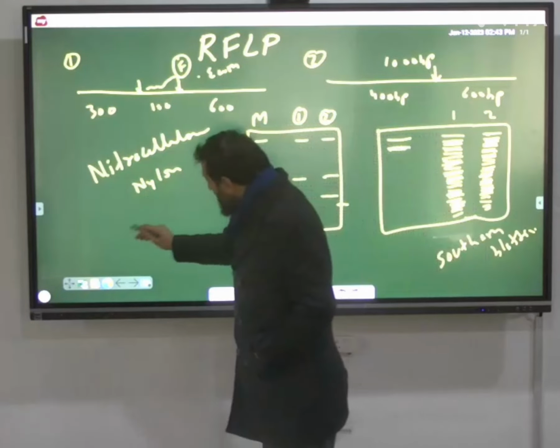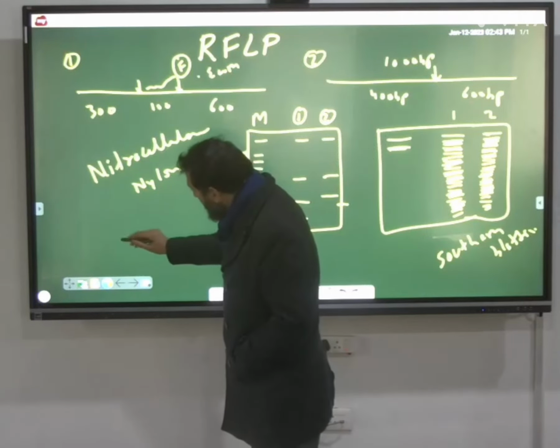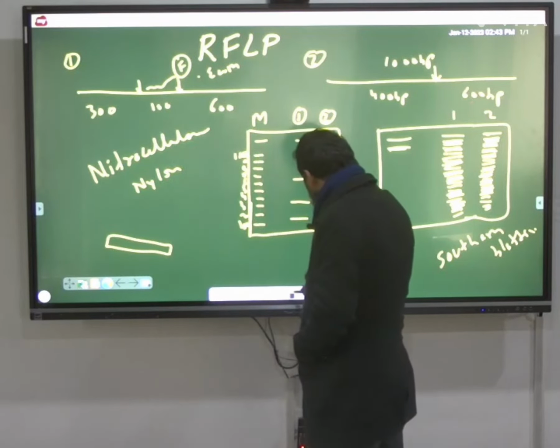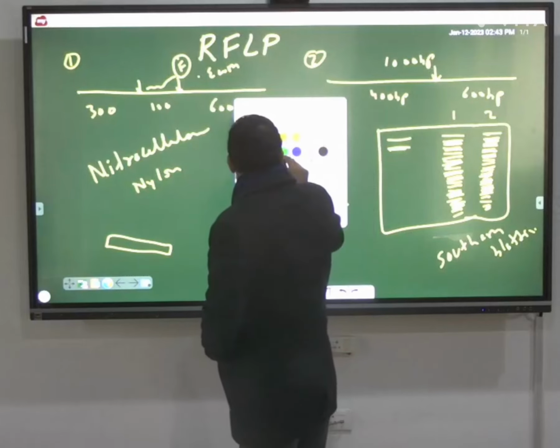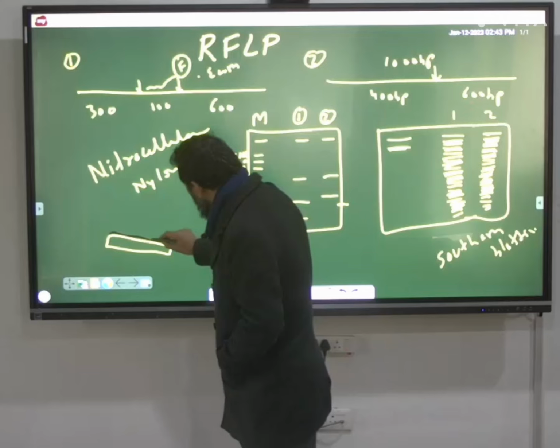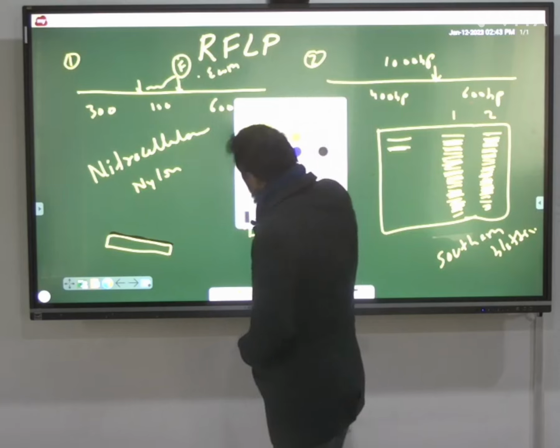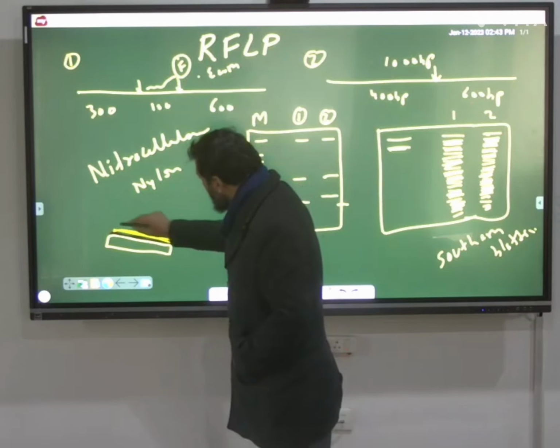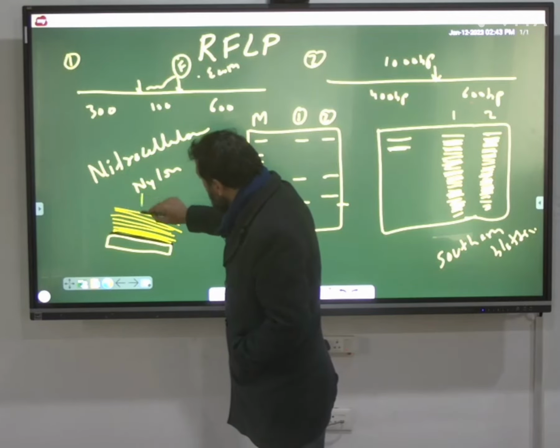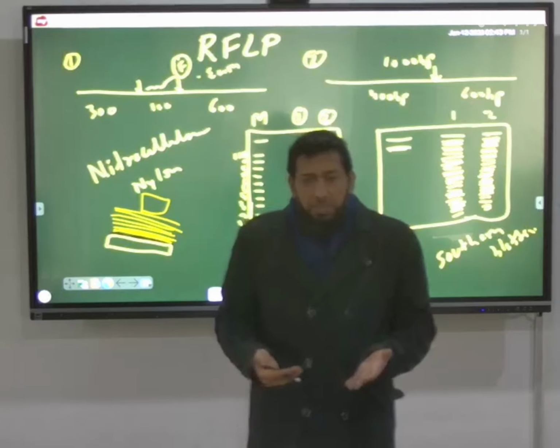And so what we do, say for example, इस gel को हमने ऐसे देखा, ठीक है, from the side. So this is your gel. इस पर हमने अपना nitrocellulose membrane रखा, और उस पे हमने बहुत सारे ब्लॉटिंग पेपर्स रखे, और हल्का सा वेट इस पर रख दिया हमने. And we can keep it overnight, या आजकल ट्रांसफर मशीन है जो जल्दी ट्रांसफर कर देते हैं.